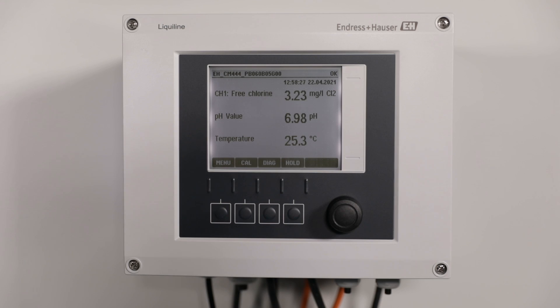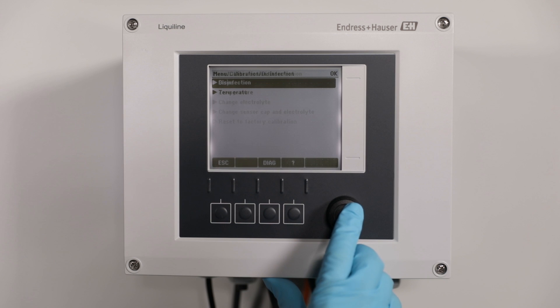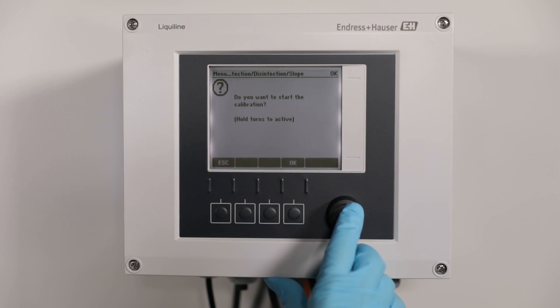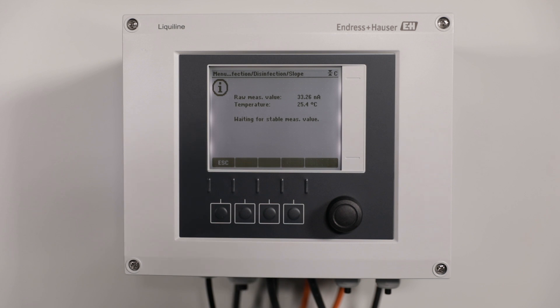Now start the calibration procedure at the Liquiline transmitter. Press Cal, then Disinfection, then Slope, then Sample Calibration. Start the calibration and press OK. The transmitter checks that the stability criteria are fulfilled and stores the present value for the later adjustment.